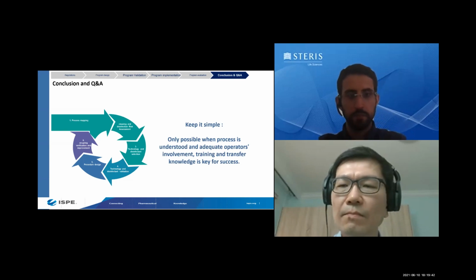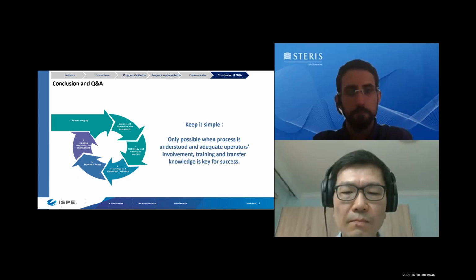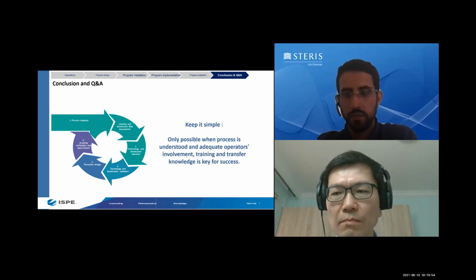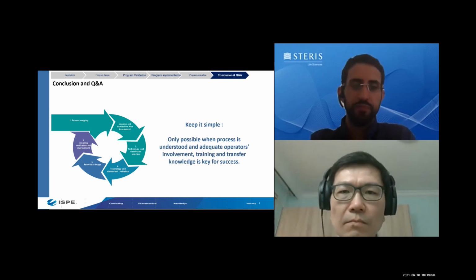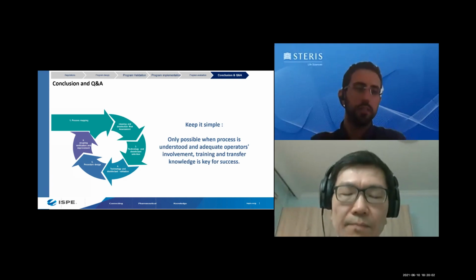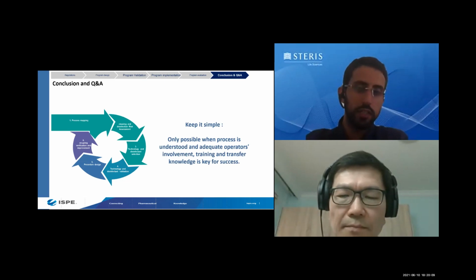Michelle asks: when preparing the EM cleaning validation protocol, as you are essentially starting with a dirty clean room and are likely to get counts on your plates, do you only set acceptance criteria after the final clean EM? Yeah, that's a great question. Richard, do you want to go ahead, or shall I? Yeah, go ahead. Okay, I think that's a great question.